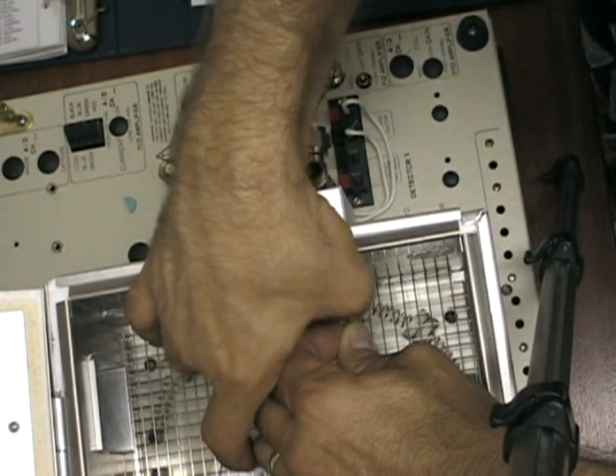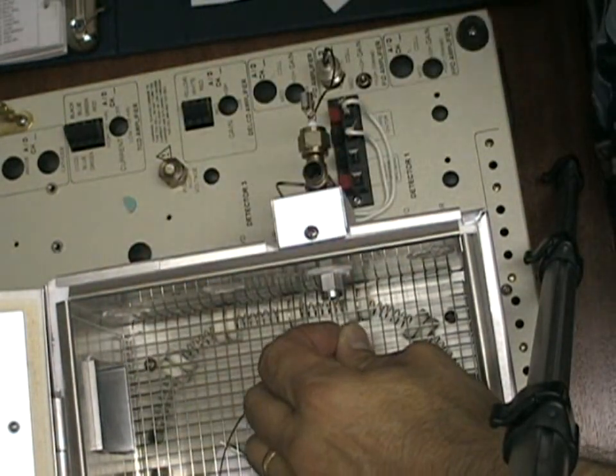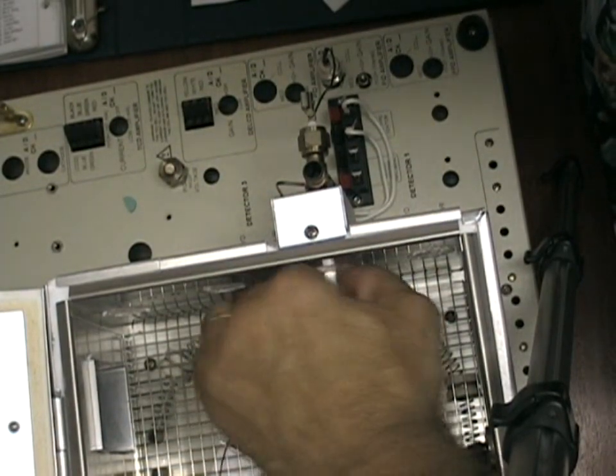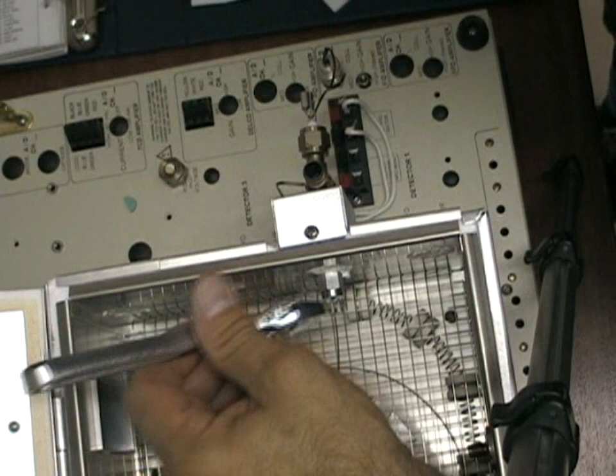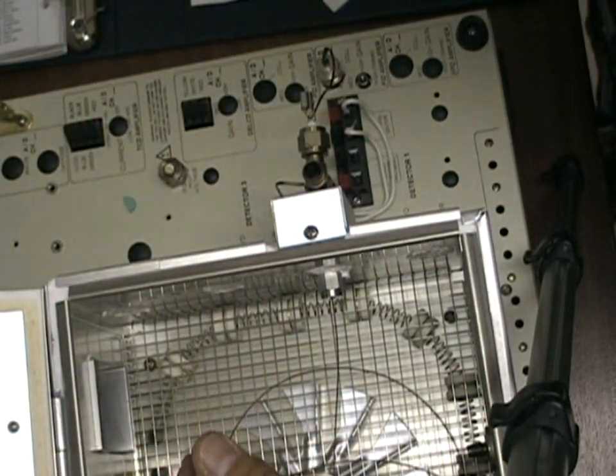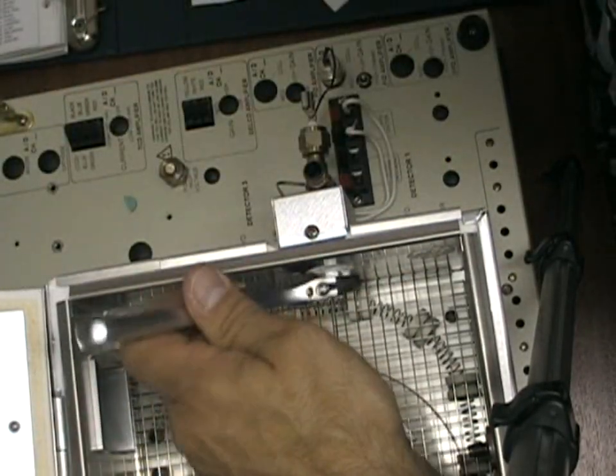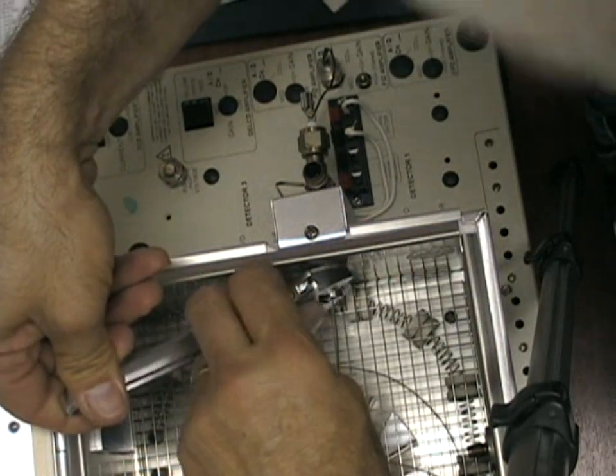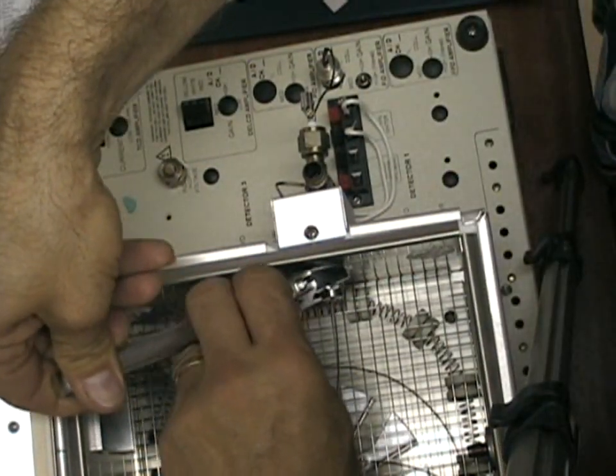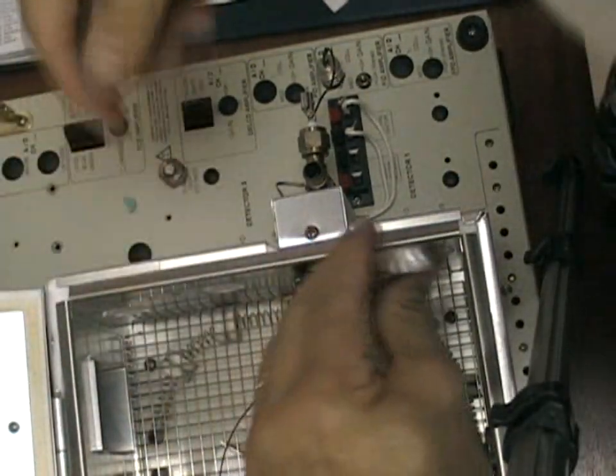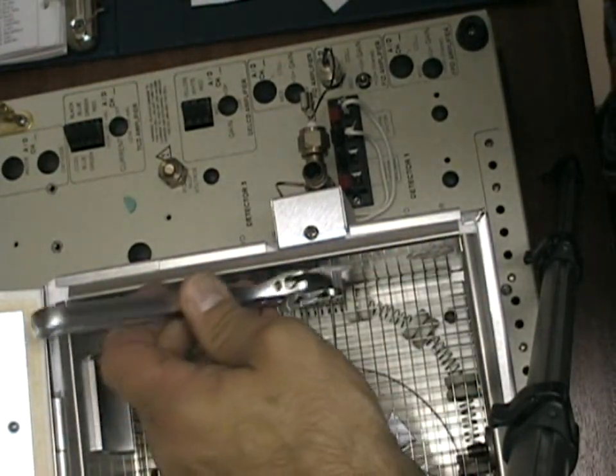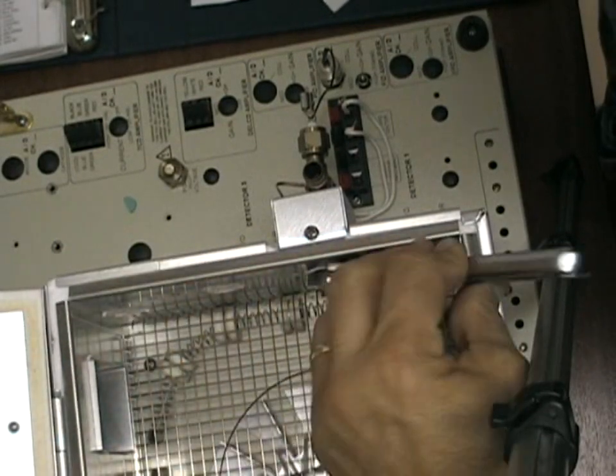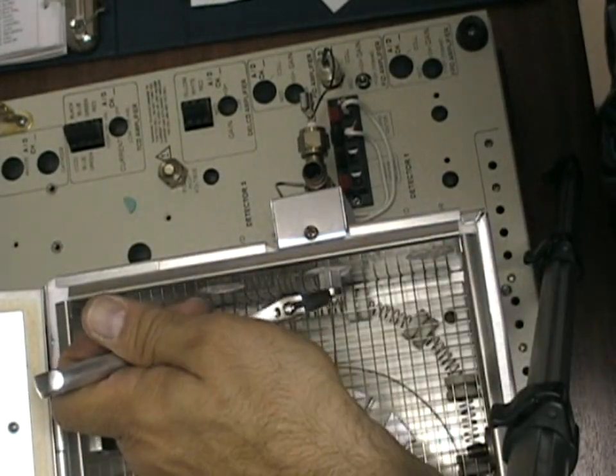At this point, tighten the nut by hand, and again using the wrench, tighten three quarters of a turn past finger tight to create the gas tight seal. This will ensure proper operation of the FID with good response from the peaks.